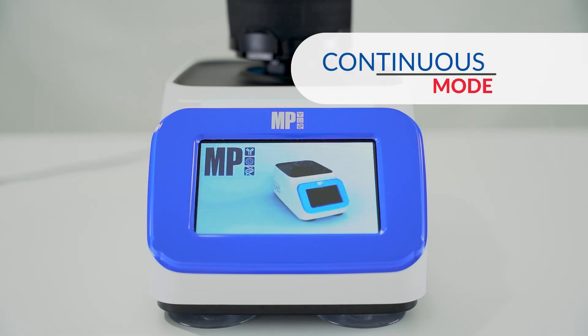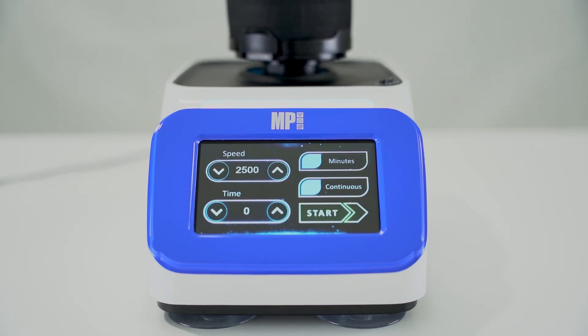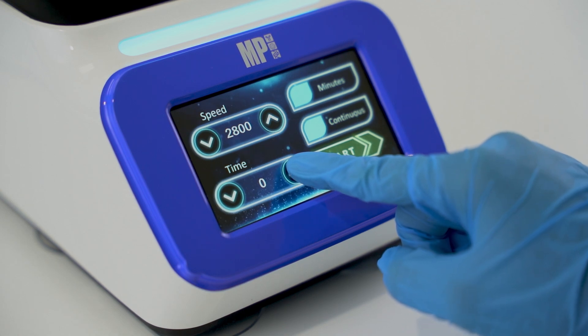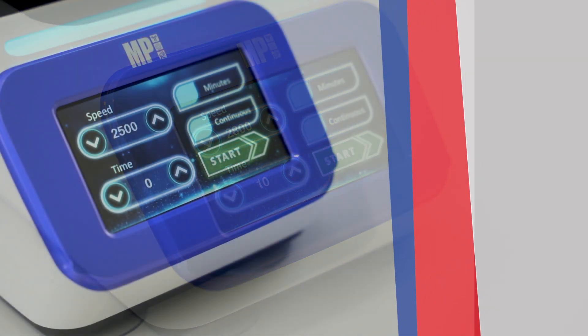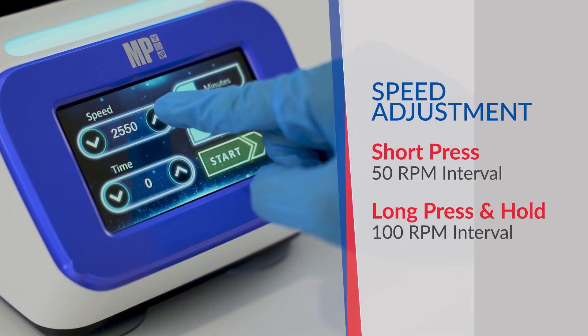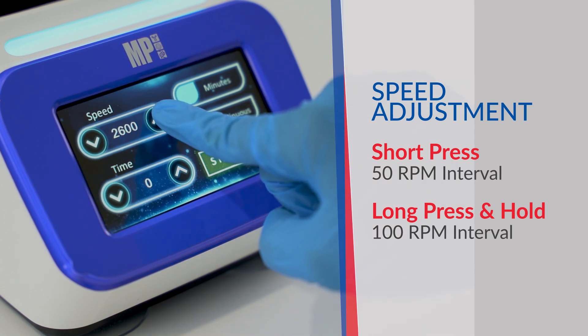Before commencing the operation, you can easily adjust the vortex speed and duration from the touchscreen LCD. Rotation speed can be adjusted by pressing the up or down arrow. Short pressing the speed arrow increases or decreases by 50 RPM, or long press the button to change the speed by 100 RPM.